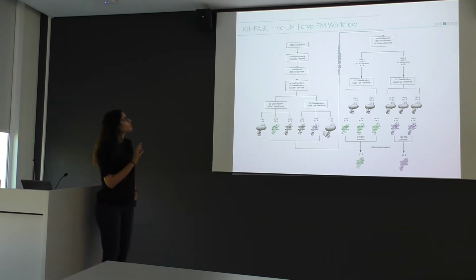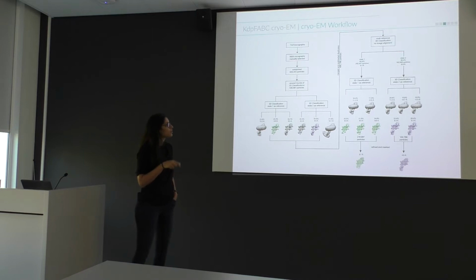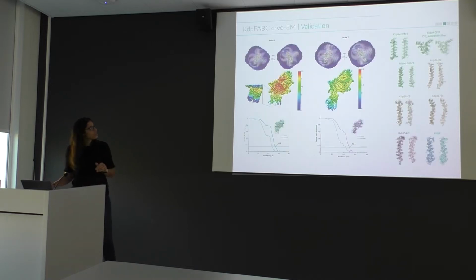So that we then were finally able to obtain a good data set. I'm not going to go step by step into the cryo-EM workflow, but we really started with an extensive number of micrographs, and already very early on during the image processing workflow, we realized we actually have a heterogeneous data set. So we had at least 2 populations in it, and this is also what we at the end managed to separate, into 2 distinct populations, which we call state 1 and state 2.